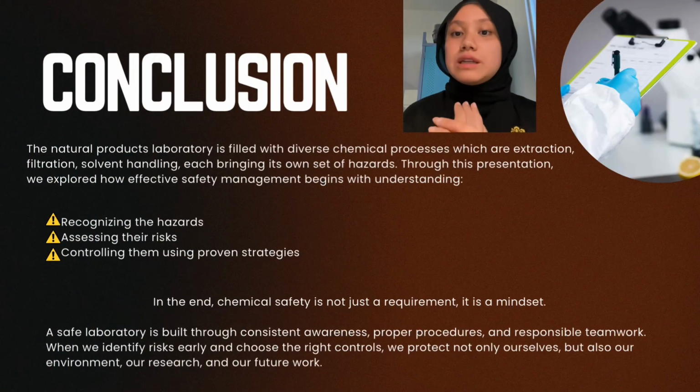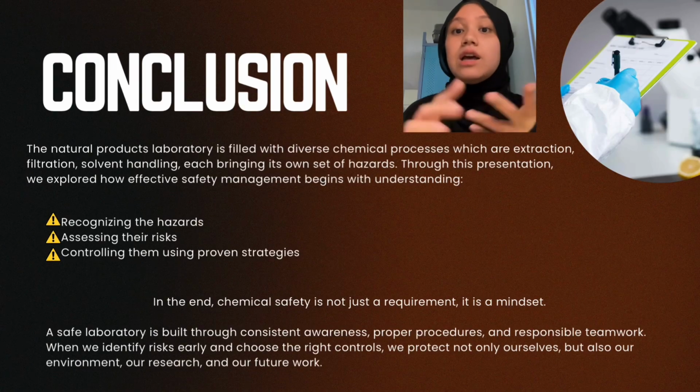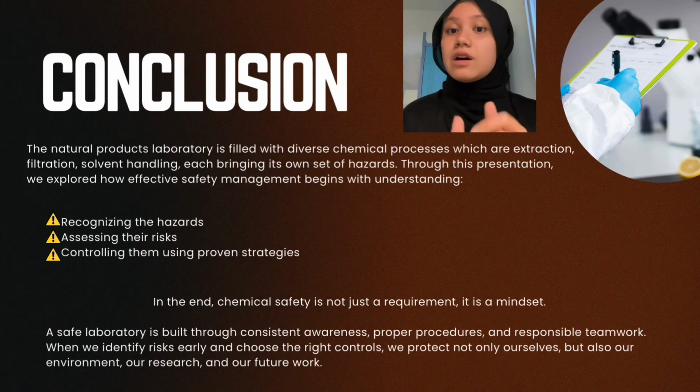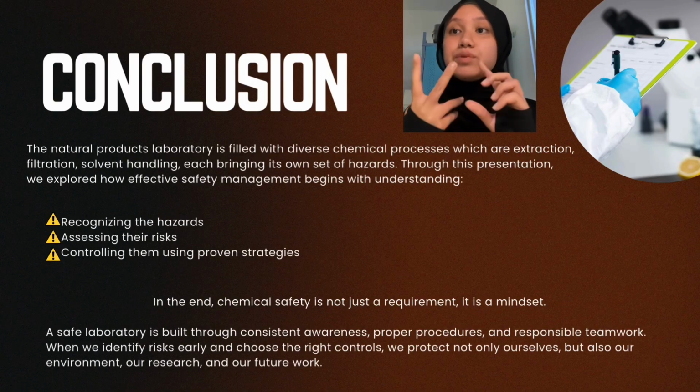In conclusion, the Natural Products Laboratory is filled with diverse chemical processes, which are extraction, filtration, and solvent handling, each bringing its own set of hazards. Through this presentation, we explored how effective safety management begins with recognizing the hazard, assessing the risk, and also controlling them using proven strategies.